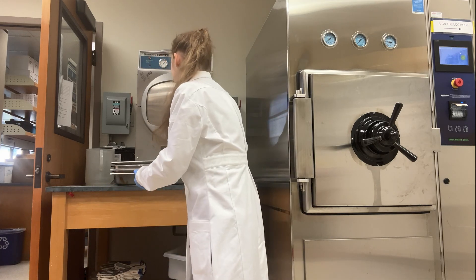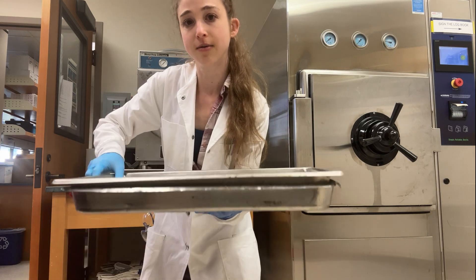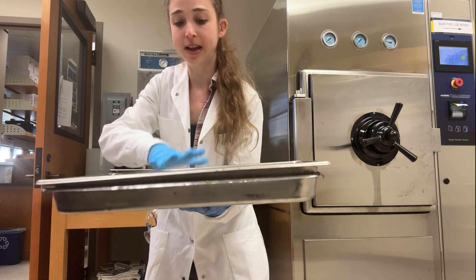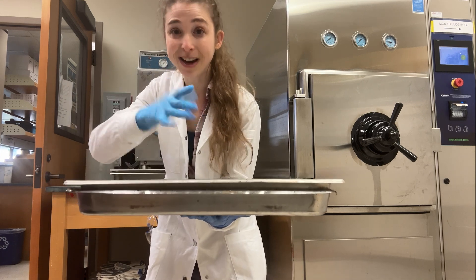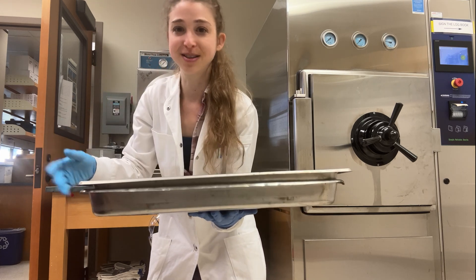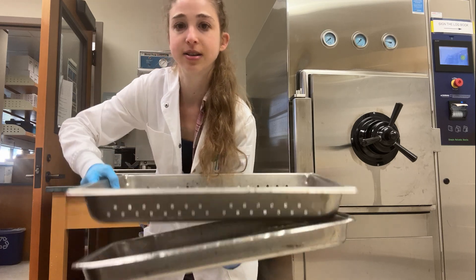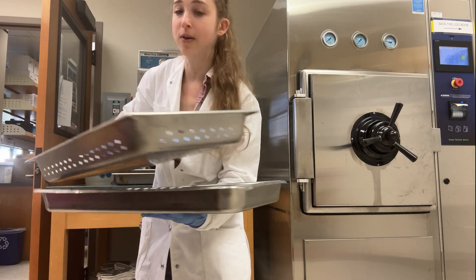When you have liquids, it's helpful to put them in one of these metal racks that has holes in it. This way, any liquid that forms — because on the liquid cycle things get kind of wet since it doesn't do the same kind of drying out — you're going to have some liquid in there. The easiest thing is you can just lift this rack up and then you'll have liquid in the tray that you can pour out.